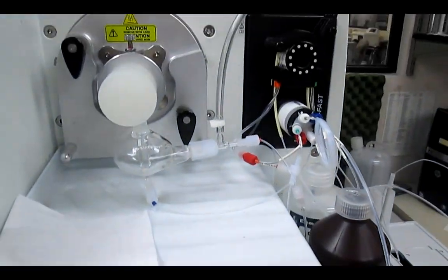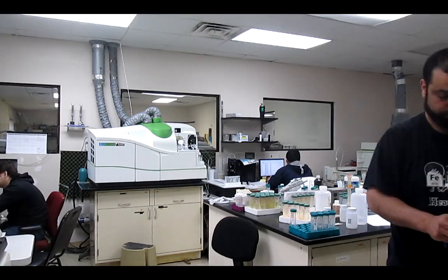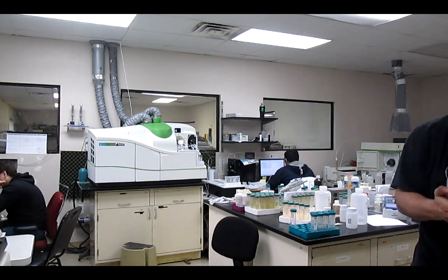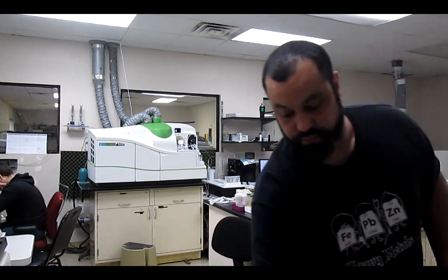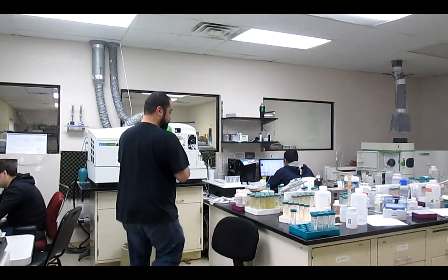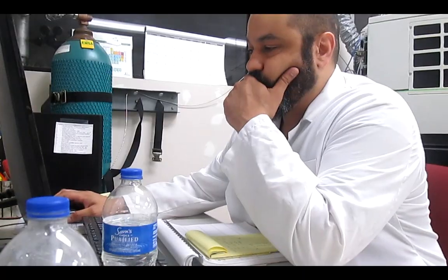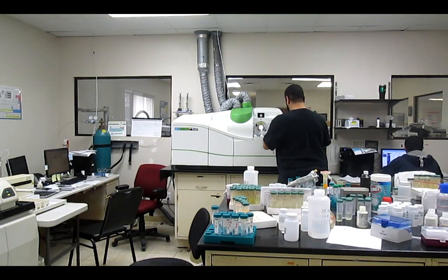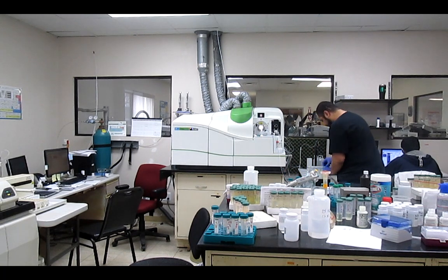You can directly inject your sample in a mass spectrometer. An ICP-MS is the instrument of choice for this analysis, and borrowing one from an environmental lab, for example, is easy enough, just as long as you misplaced a few nickels. Anyway, because we are looking at raw ratio, there is no need to do any calibration beyond the normal daily tuning. The only thing I did is to set up a method to include the isotopes I wanted, increase the dwell time from 50 to 100 milliseconds, and added replicates for a better RSD. If you need more details about doing analysis on the mass spec, let me know.